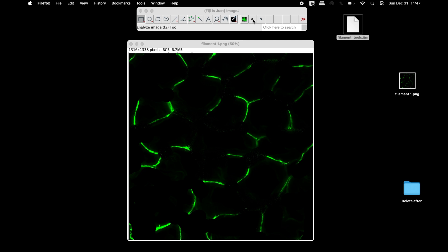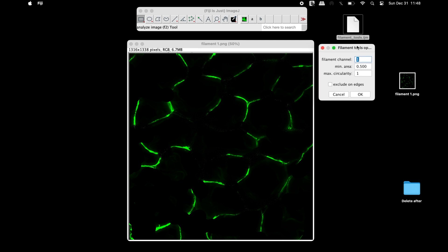To quantify the filaments, make a right-click on the second icon, A. Set 1 to specify the channel having the filament image.